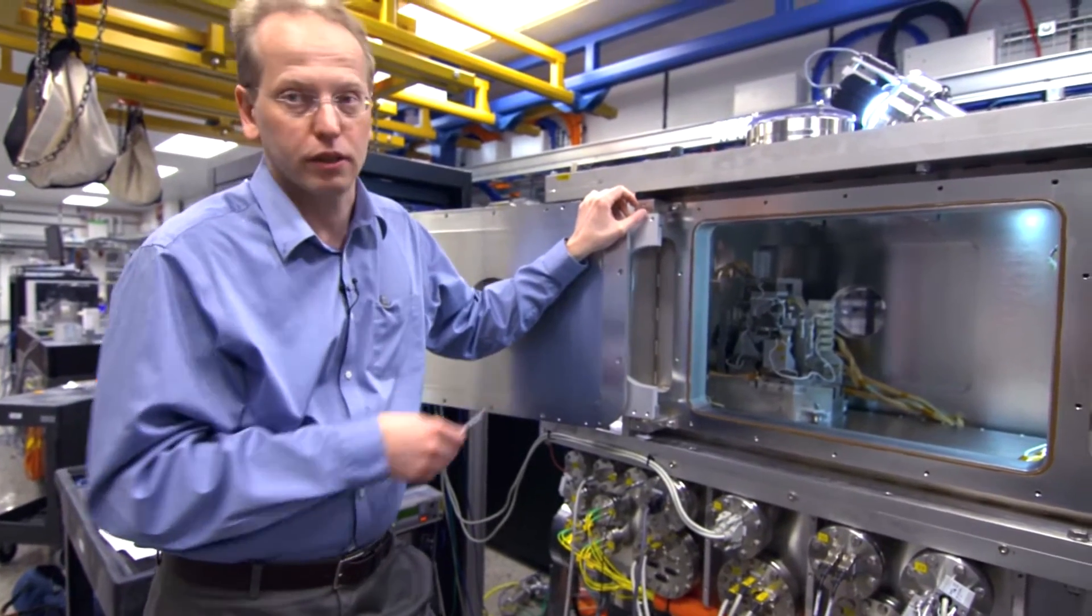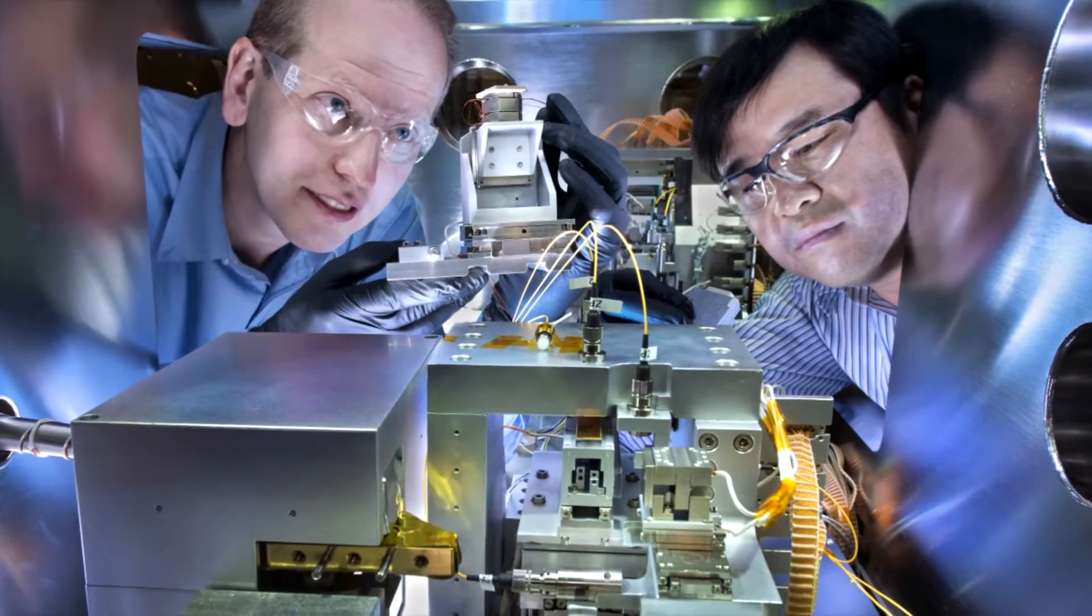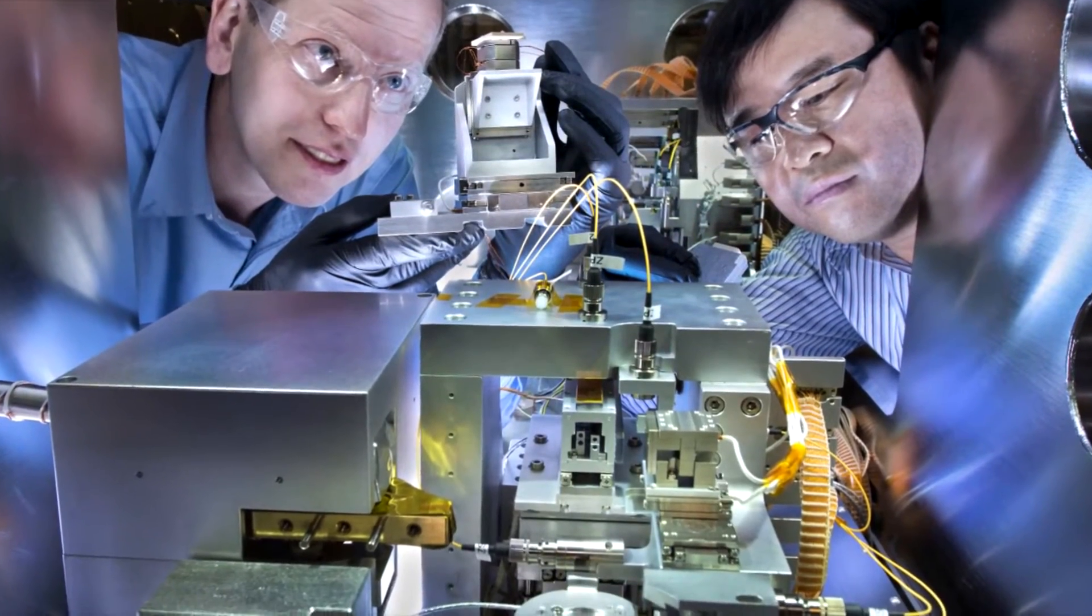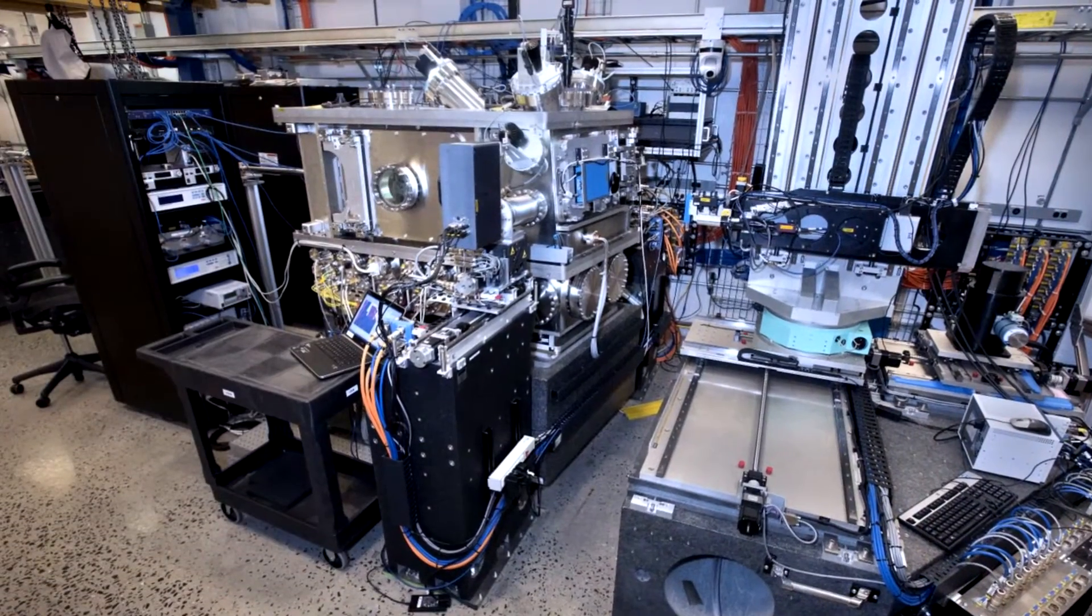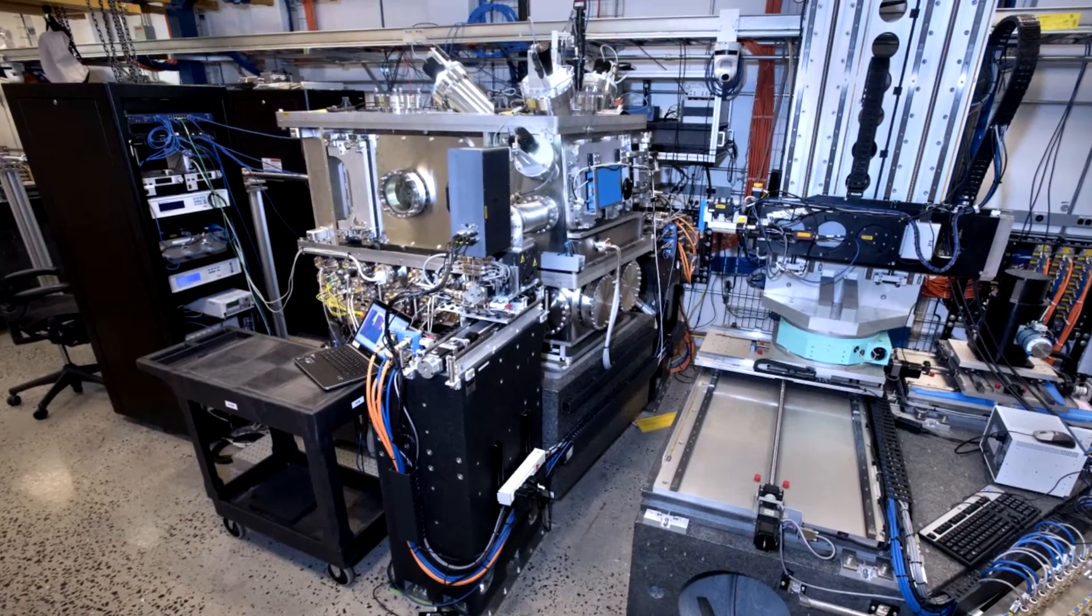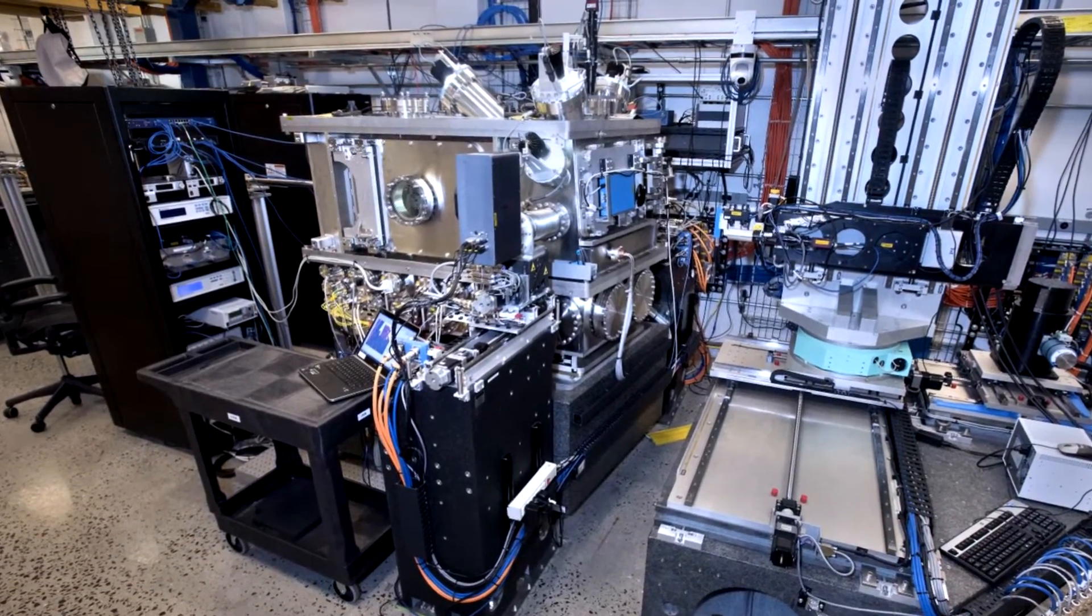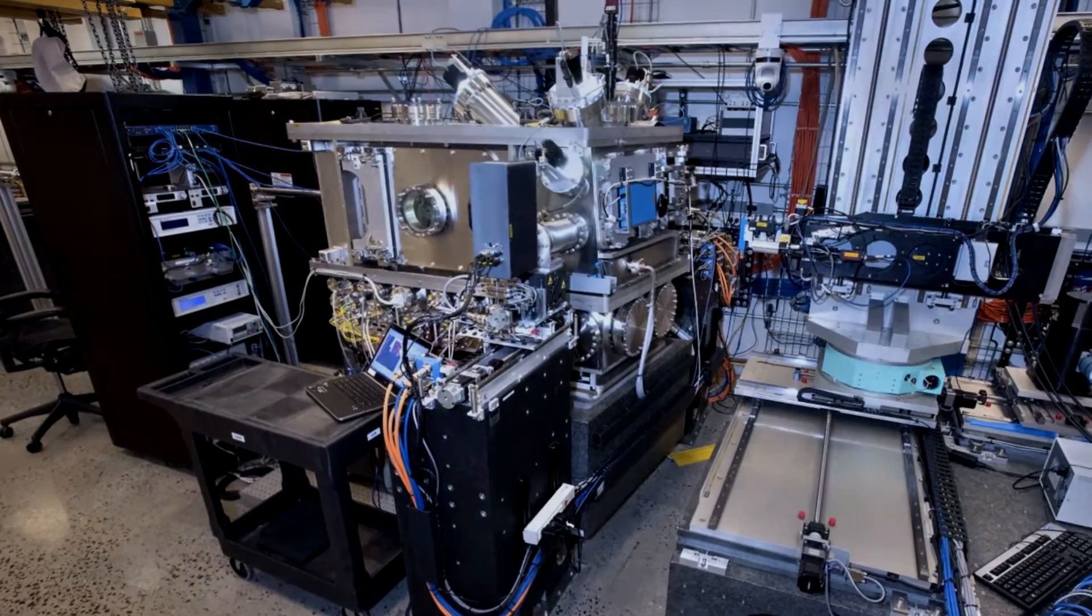This makes the system unique. The MLL microscope is a great general-purpose X-ray microscopy tool that is suitable for a diverse range of imaging applications. There is no other similar microscopy system in the world routinely providing sub-20 nanometer chemically-specific imaging in the hard X-ray regime.